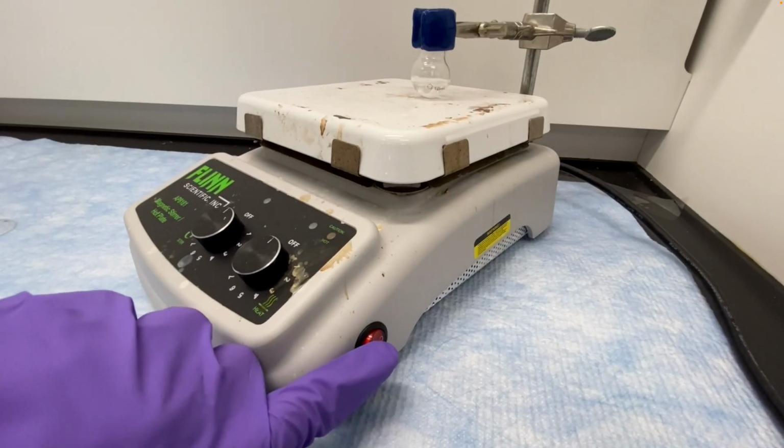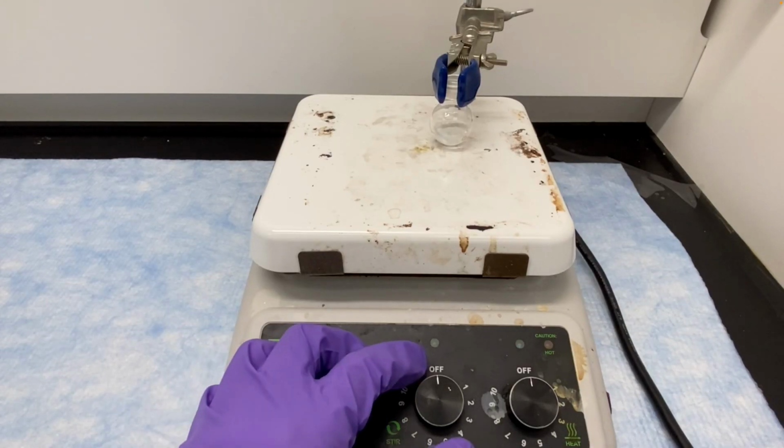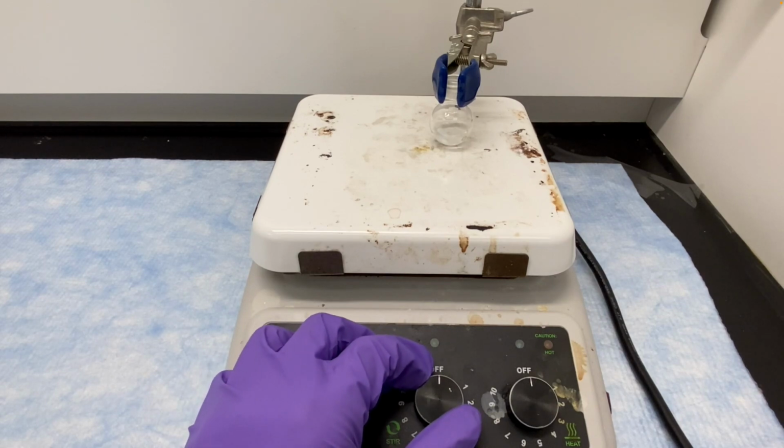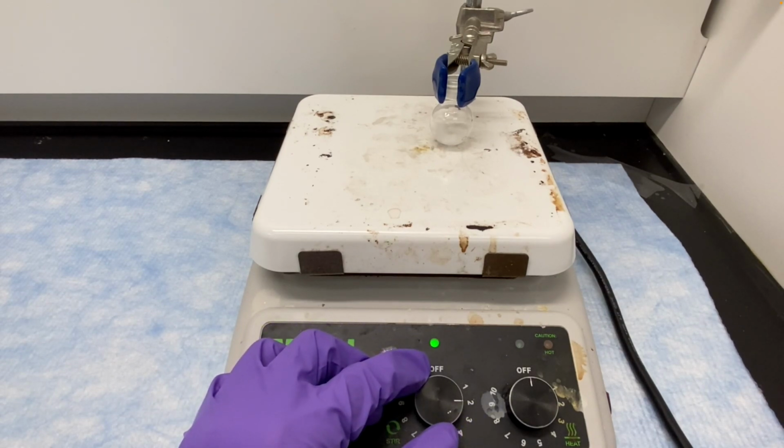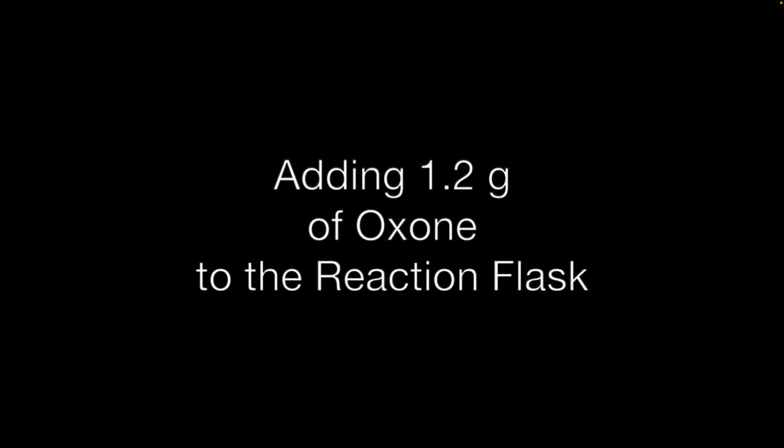So that's our solvent, ethyl acetate, dissolving the Borneol. Once we have that there, we can start stirring this. That'll help it dissolve better. So you'll turn the hot plate on, and then notice there are two knobs in the front of the hot plate. The one on the left is for stirring, the one on the right is for heating. We're not going to use the heating at all in this experiment, so you'll just use the stirring. That'll make that bar magnet underneath the hot plate start spinning. That'll make the little magnetic stir bar we put in our flask spin with it, and that'll mix our solution.